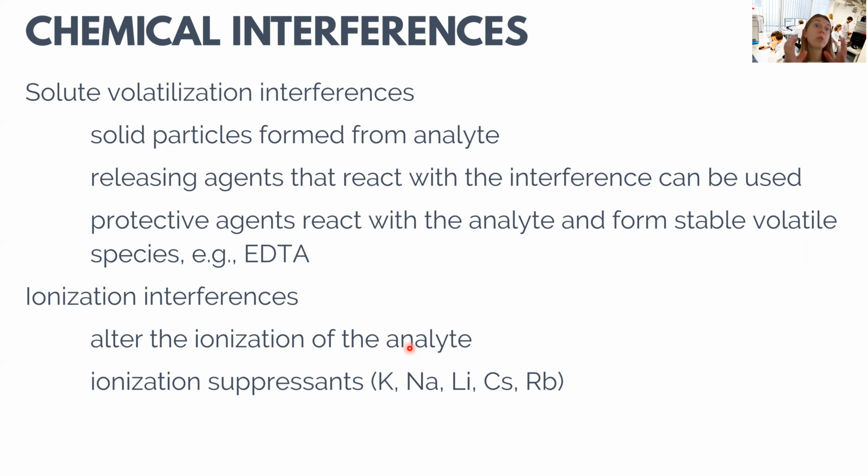And this results in the formation of solid particles formed from the analyte in the atomization source, instead of forming the gas phase atoms. So before the gas phase atoms can be formed, our analyte is precipitating into solid particles due to the presence of other compounds in the sample.